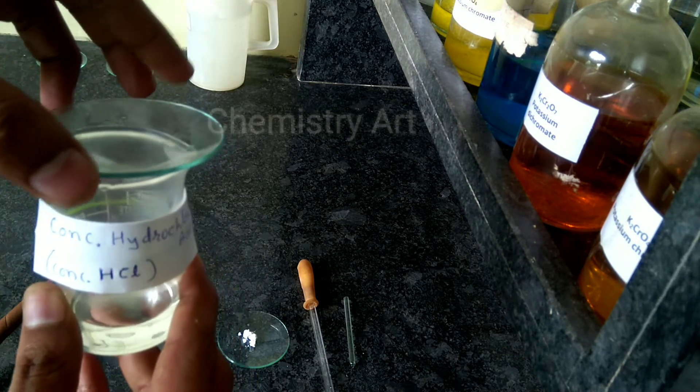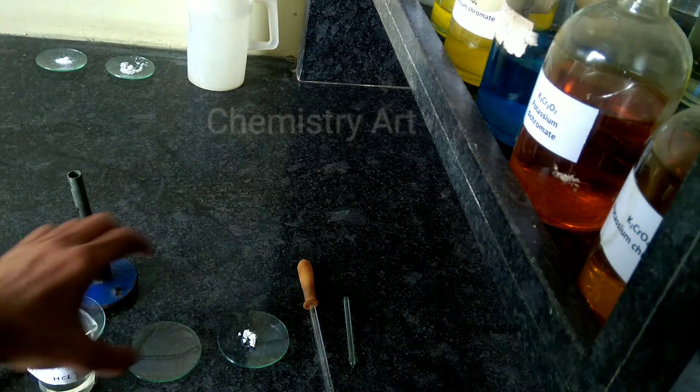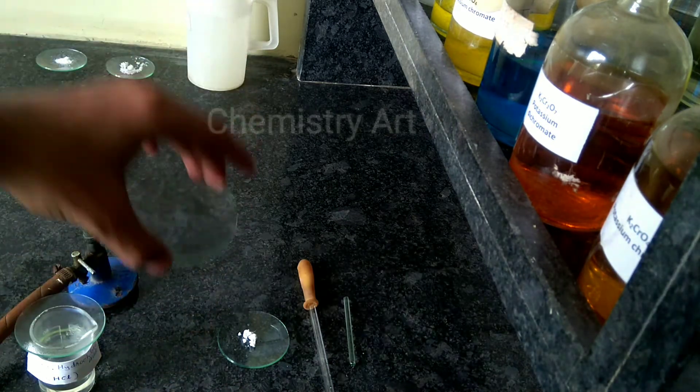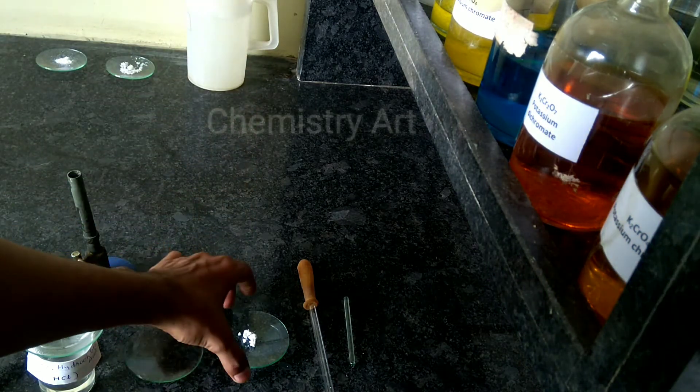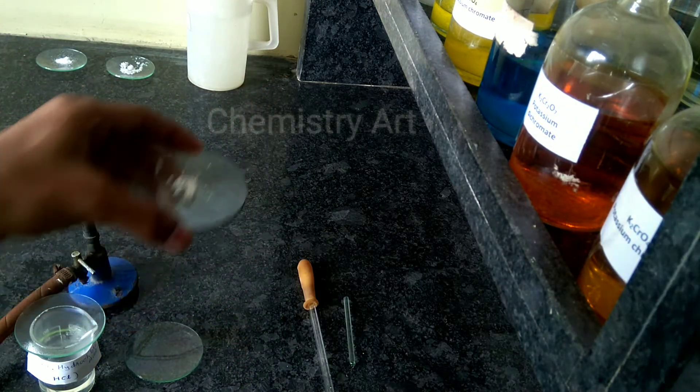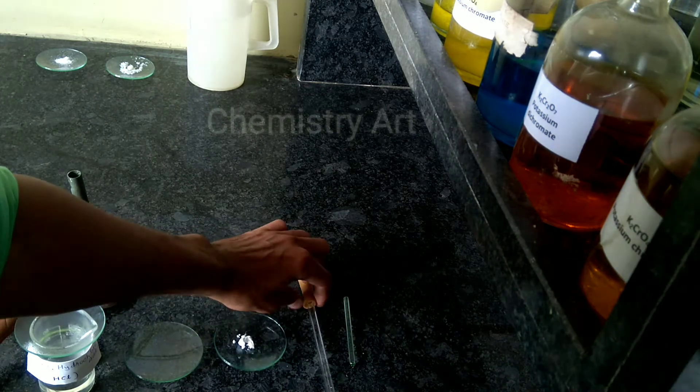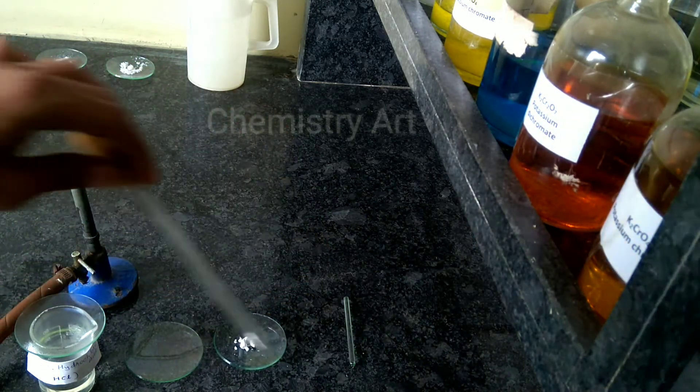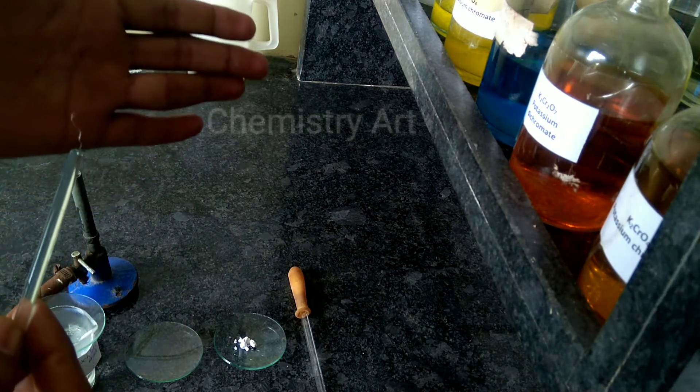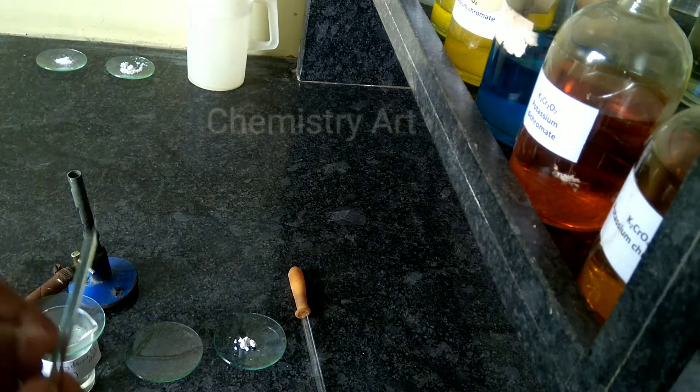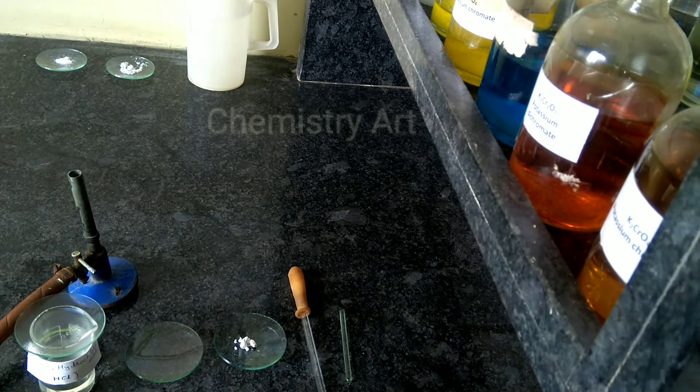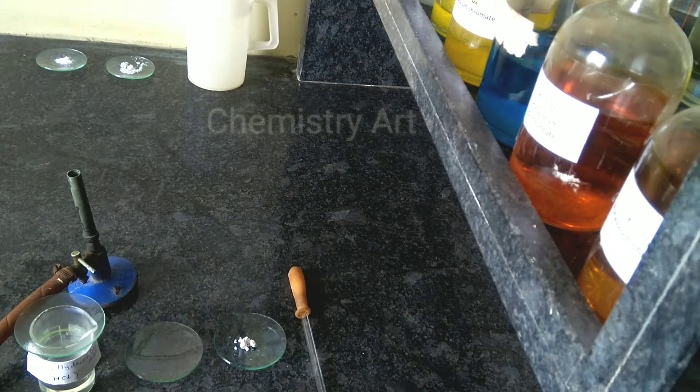For that we have here concentrated hydrochloric acid, the salt we are going to check, a watch glass, a dropper, and the very important thing is the platinum wire. Here you have to make a loop of it, then the burner. Now let's start the flame test.